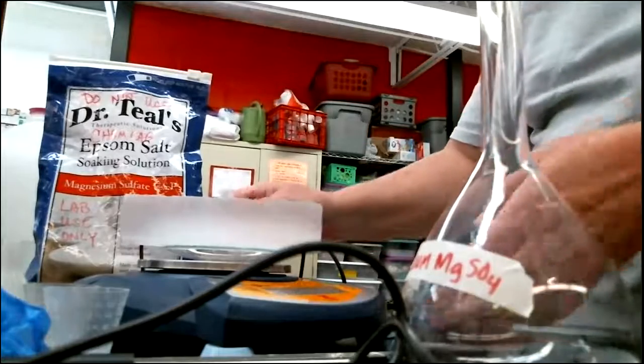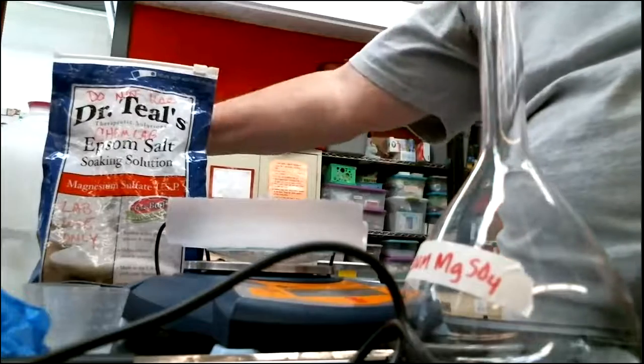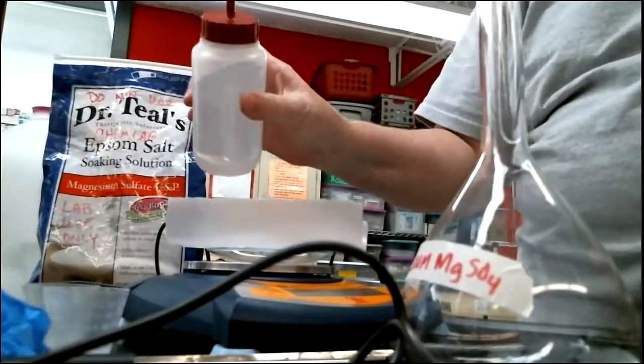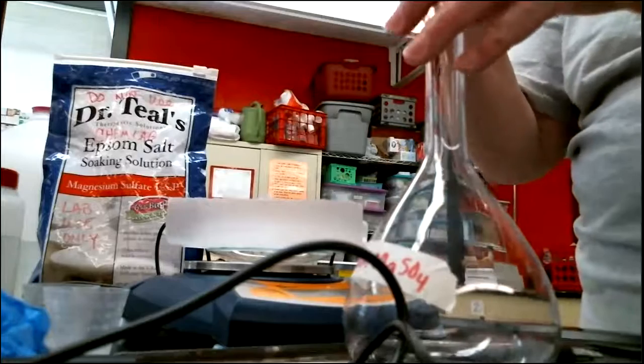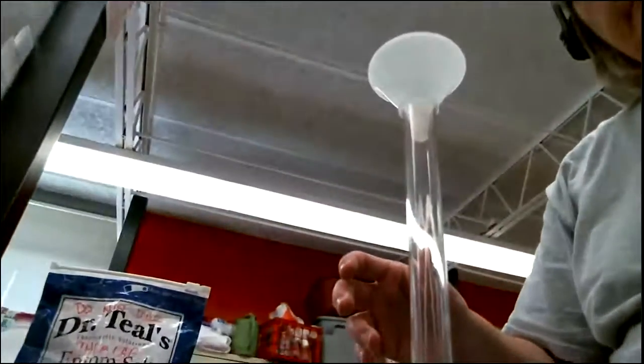All right, so here's my balance. Here's my Epsom salt I showed you a few minutes ago. Here's the distilled water. I have water in a wash bottle that we use to clean the funnel as we put the salt down in the volumetric flask. Here's the volumetric flask. It's got a funnel in it, right there.